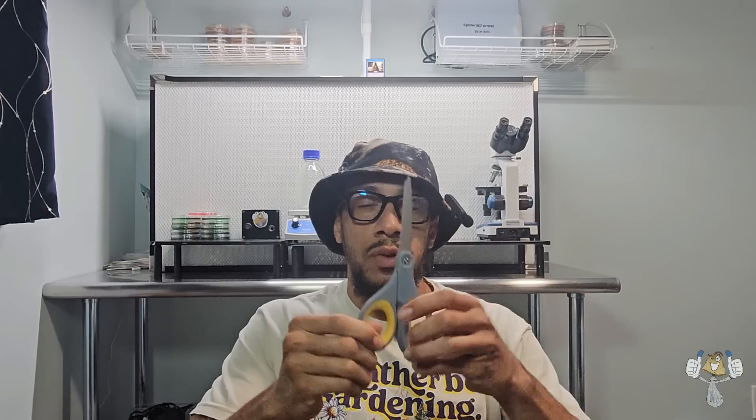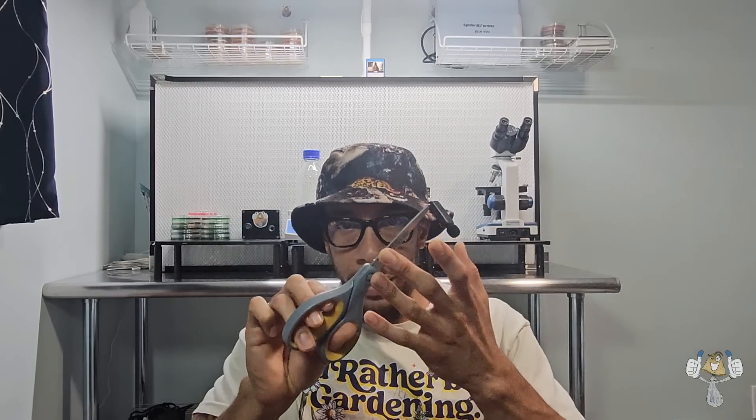A pair of scissors — a regular standard pair. If you're going to use these for mycology, just use them for mycology only. Even though we're going to wipe them down and spray them with alcohol, you want to have a designated pair of scissors that you keep inside your mycology kit.